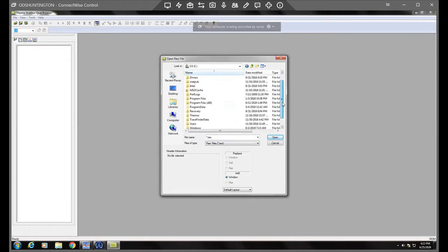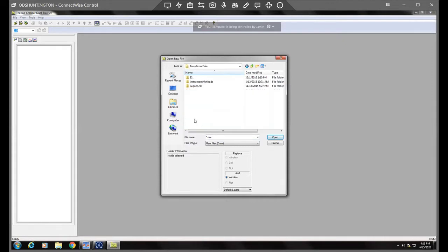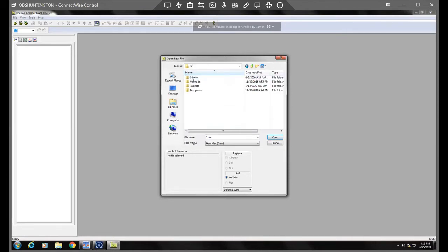Then you scroll down to trace finder data, open that up and then 32 or 33, which is 3.2, which is the version we're on.